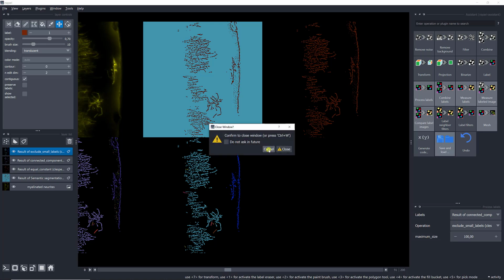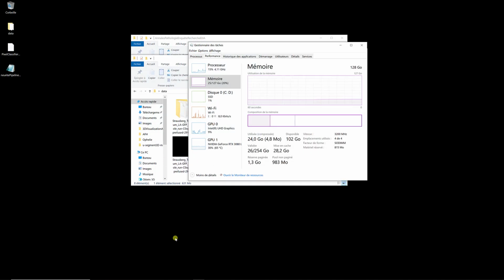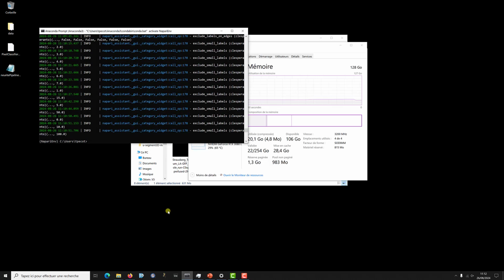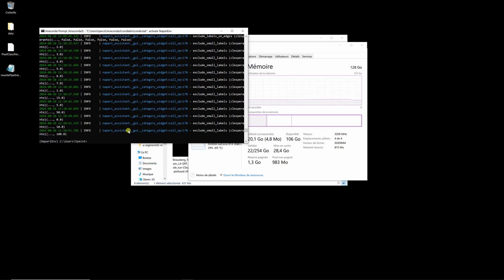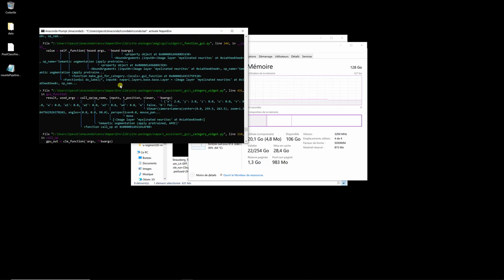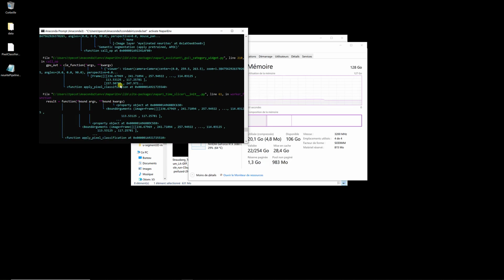close Napari. So I won't lie, the Napari Assistant is not probably the most stable plugin. When you do it right, you can definitely still do quite interesting things. So I think it's a nice tool. But sometimes, if I go back in time, you see you have some errors sometimes, which is fine.